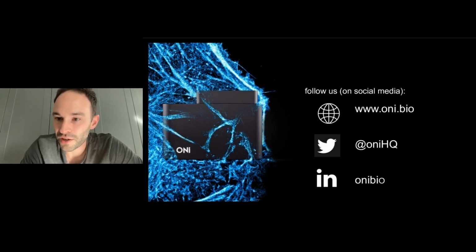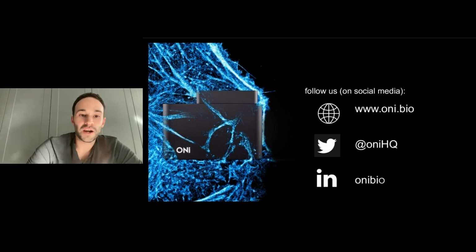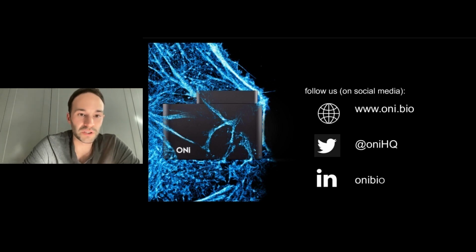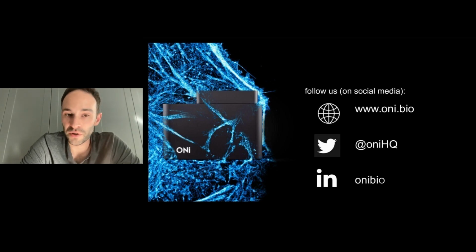We have a question here: how many colors can you look at simultaneously? Well, the system has 4 different lasers. So in principle, all 4 of them can be on simultaneously. And it captures 2 halves of the camera at the same time. So generally, we recommend imaging 2 colors simultaneously, but in principle, you can do more. When it comes to dSTORM imaging, we generally image 1 color at a time, but that's because usually you're looking at fixed samples, so it's not really advantageous to do simultaneous imaging. But for live imaging, that's perfectly possible.